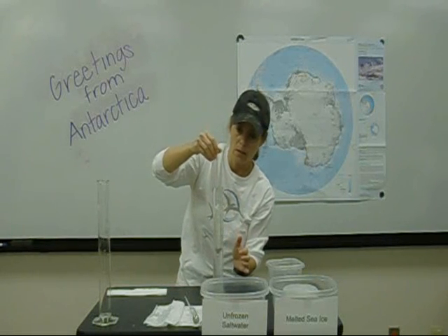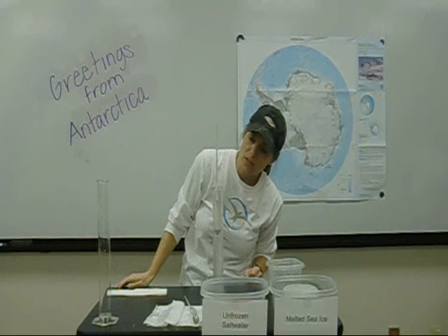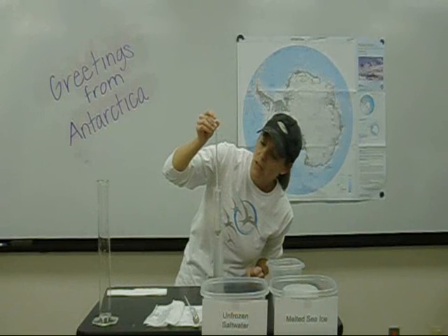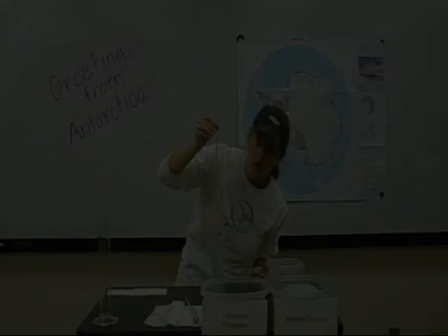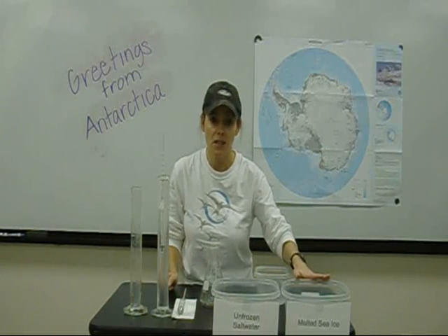Carefully put it in. Whoa. All right, so this is the unfrozen salt water, and the density, let me turn it just a little bit, is about 1.031.